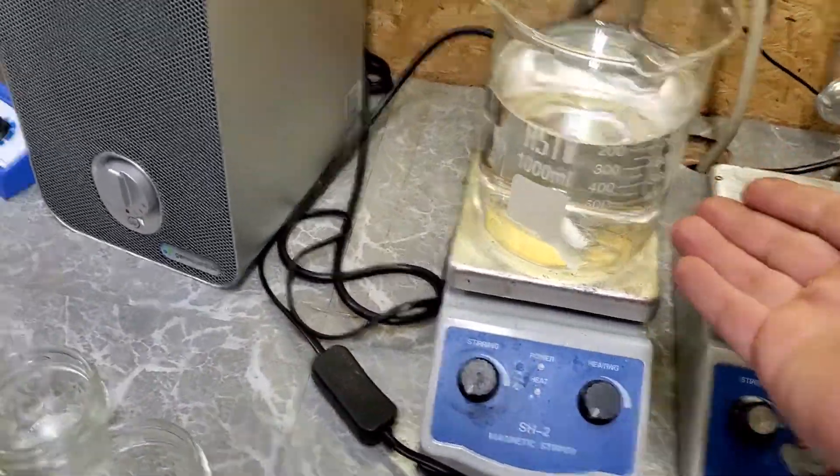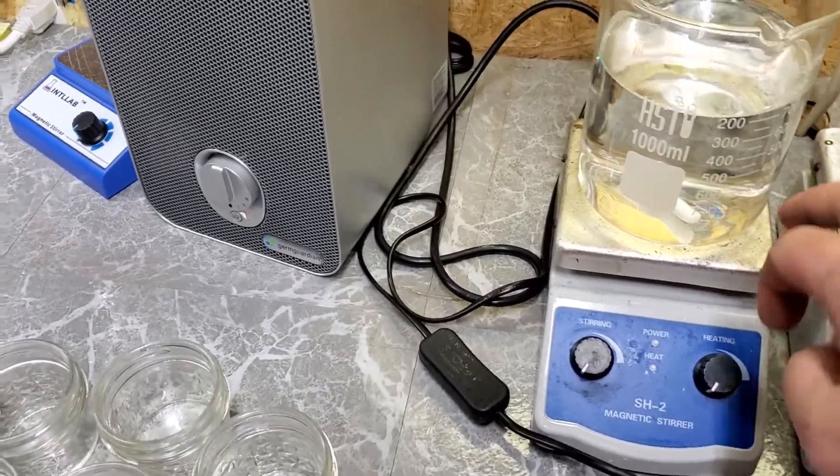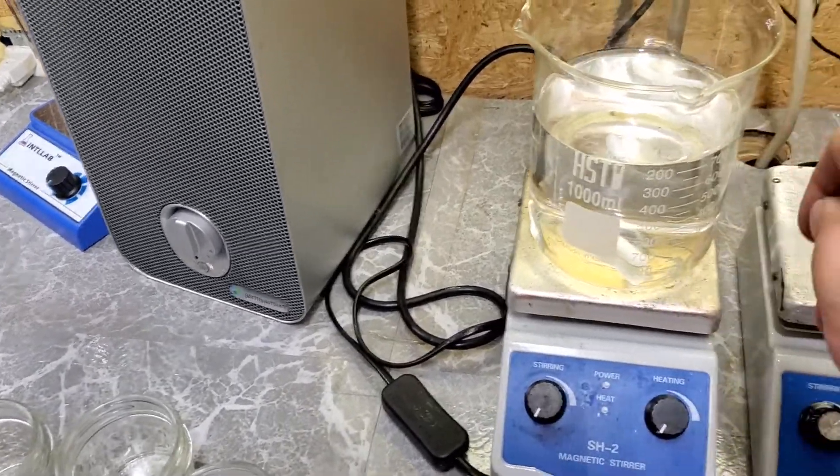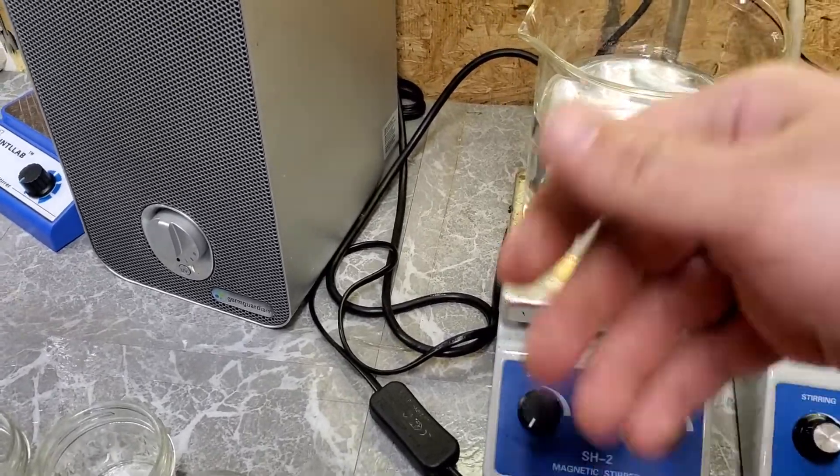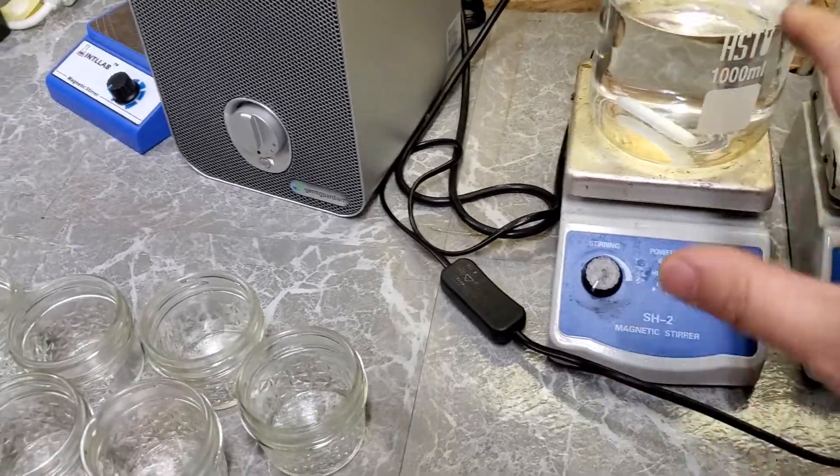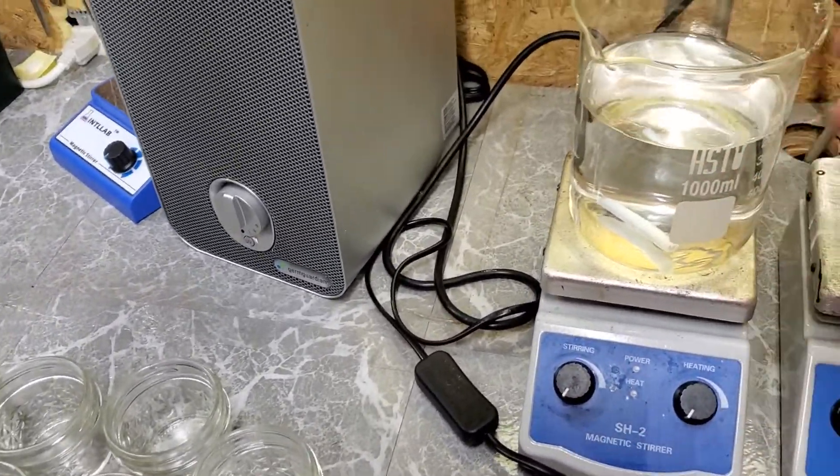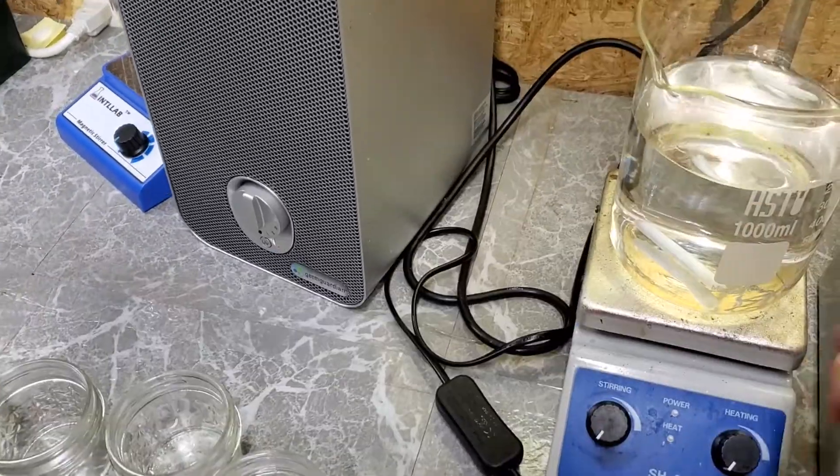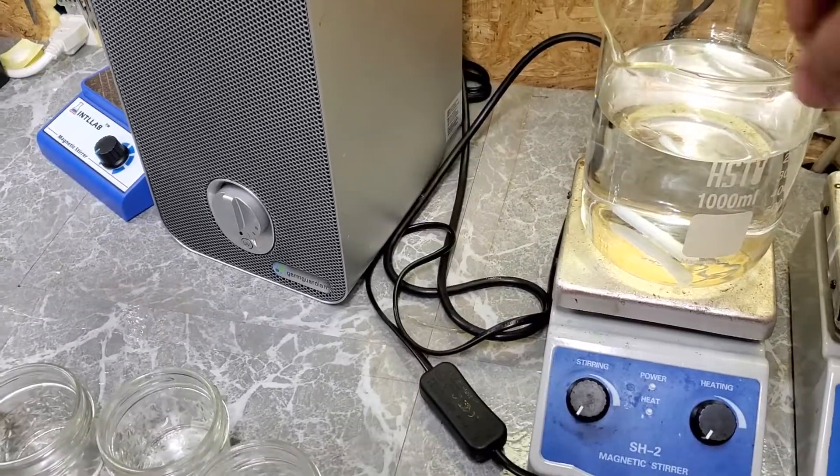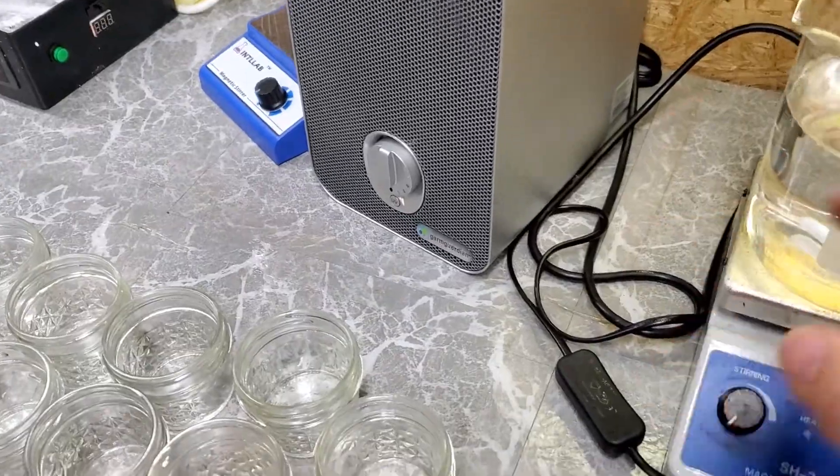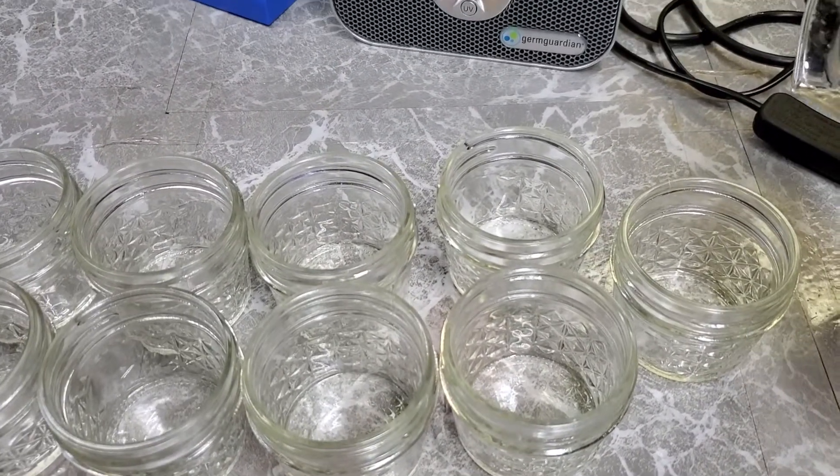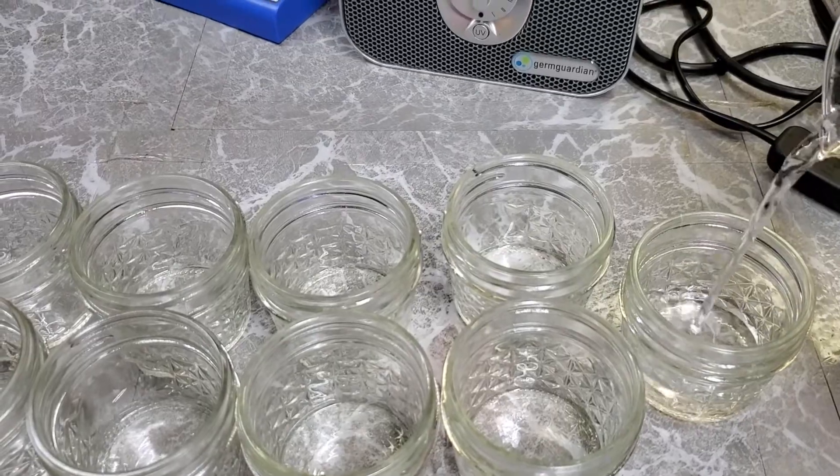Now real quick, you do not need a beaker and a magnetic stir and magnetic stir bars and all this. You can just use a spoon and a Pyrex cup or even a regular drinking cup. You do not need any of this lab equipment. This is just what I have out here, so I'm going to use it to make it a little bit easier on me. But yeah, you can just do this in a regular mixing cup or whatever and then use a spoon to stir all this together.